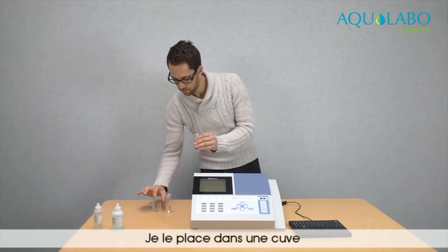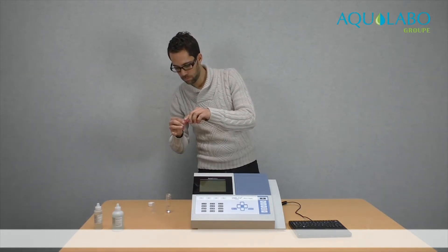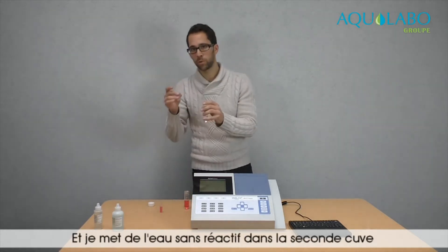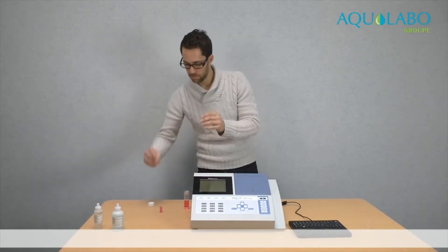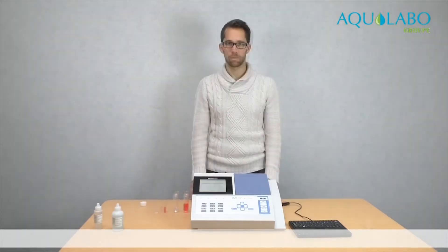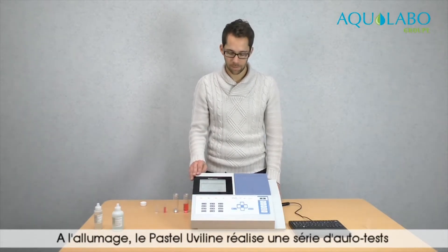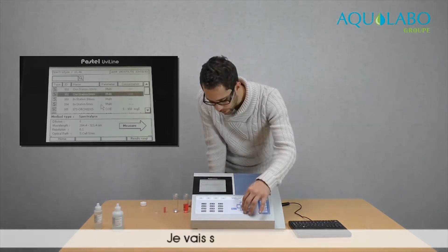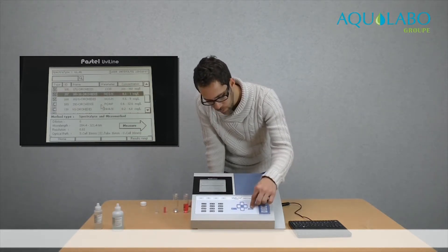I will put it in a cell. In the second cell, I will put the water sample without reagents. After switching on the Pastel UV line, it makes a series of auto-tests, and then we reach the list of analyses. Then I go to nitrates and I press start enter.